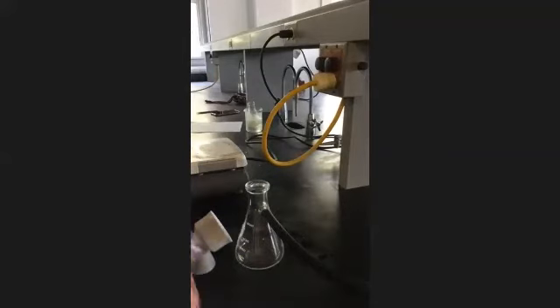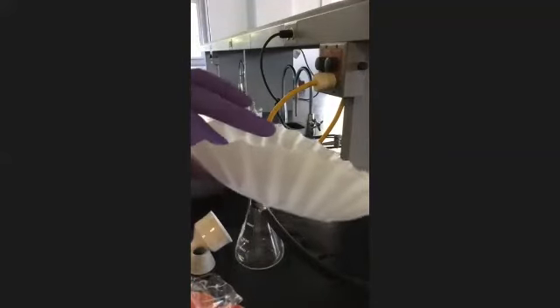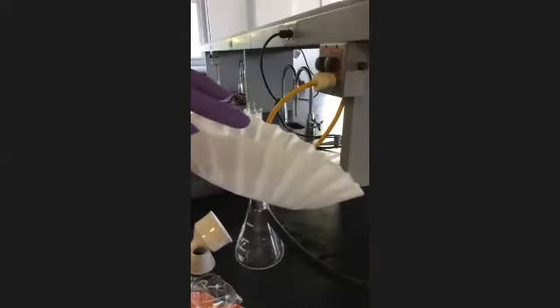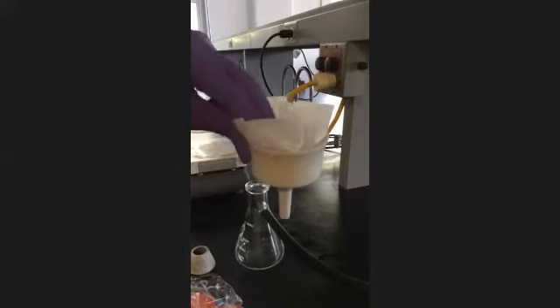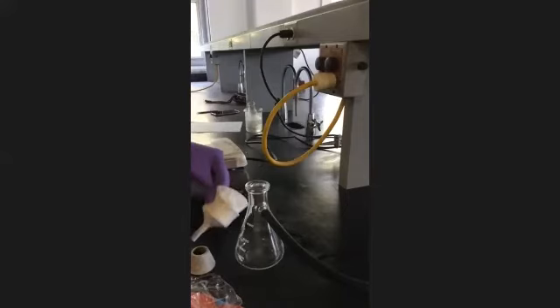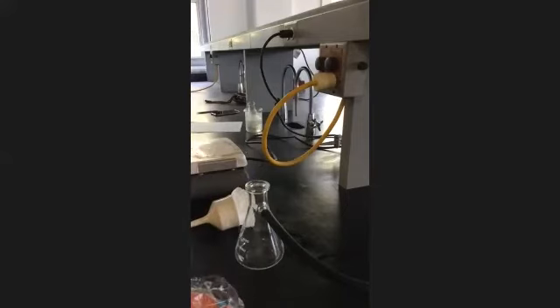So we're gonna take a piece of a coffee filter, just a regular coffee filter, 100, 200 for $1 at Walmart. And we'll sit that down into here. Now I know it's kind of big, but that makes it better at the end, right? Because then you can just lift it out. And if you want to seat it, if it doesn't want to act right, you can always just drop a little bit of water onto the filter to seat it down into the funnel. So let's get those set up for everybody, and we're gonna roll. So we need filters and filter papers for everybody.